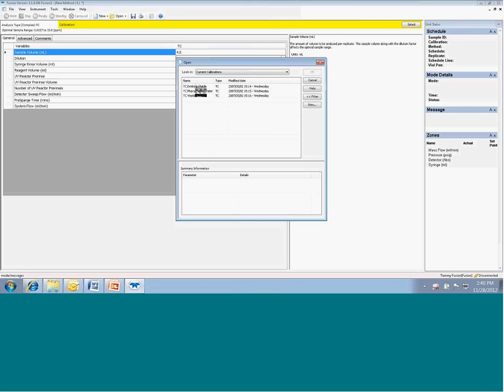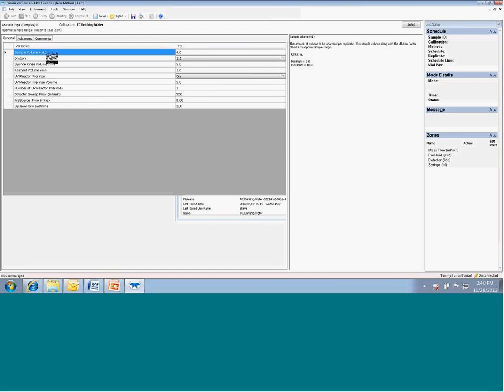Next, I can pick drinking water, pharmaceutical water, or wastewater. So let's say we're going to do a drinking water. This is our sample volume that we're going to pull for each replicate, and whether or not we're going to do any dilution on that sample. Each one of these, when you click on it, tells you over here the dilution ratio to be applied per sample, and the amount of time between adding reagent and starting to sparge the sample. You can program all of these in, or these are already default methods, and it tells you the optimal sample range up here for this method.